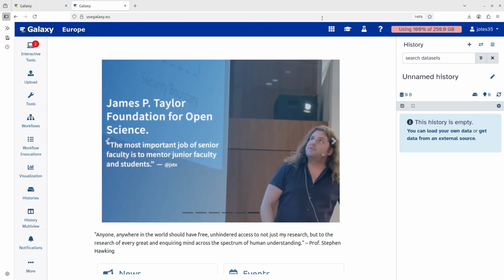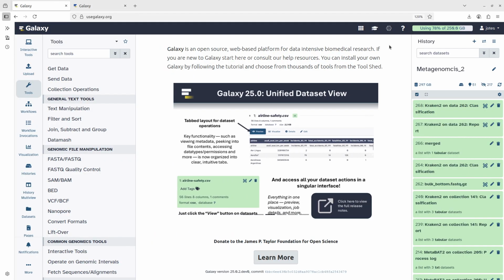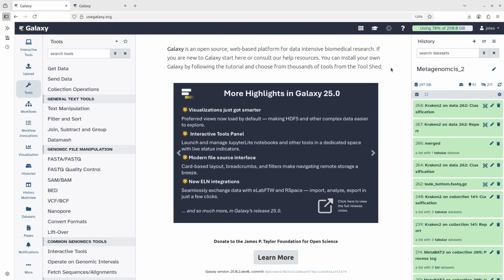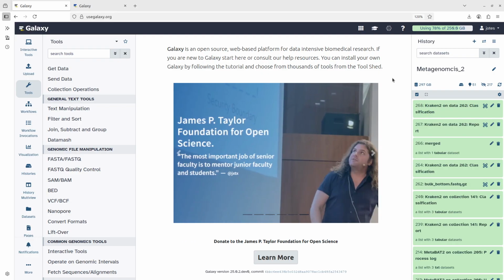All right, now I'll get back to this one here. You want to switch to the temporary storage and use that to analyze the data, and after that, the data will remain there for a month and then it will be deleted. Let me show you how to switch to the temporary storage area. Then we talk about exploring the files you have and managing them.